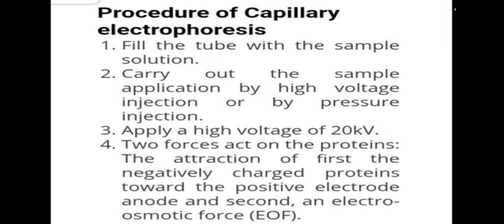Procedure. First point, fill the tube with a sample solution. The capillary tube is filled with a sample solution. Carry out the sample application by high voltage injection or with a pressure injection. Apply a high voltage of 20 kV.